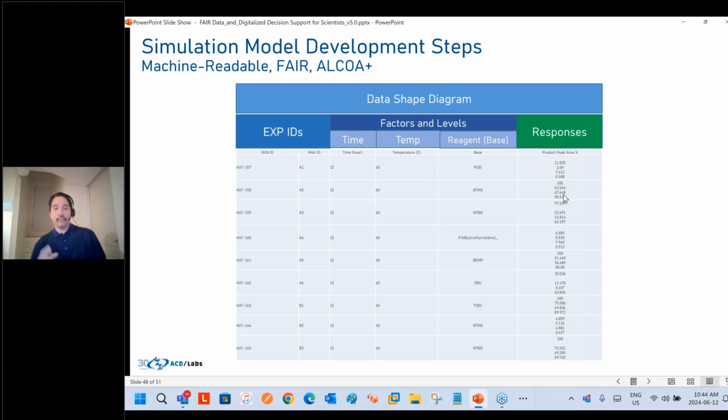And for the users, being able to view this right from the very beginning, like I mentioned, being able to say, is everything looking okay? Is everything correct? Because what we've noted from all of our work is, this is the rate-limiting step of understanding and making sure: did we process correctly? Did we miss a peak? Do we have that complete understanding to then share and socialize this data? Because by doing that, then you have trust in the data. Because again, for a lot of data scientists, the step where any issues do arise is going to be during the curation step. So having trust in this data, where you can publish these results, becomes quite crucial when you do any type of modeling work.